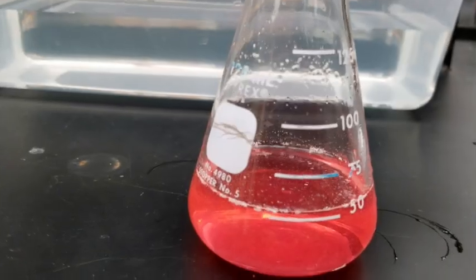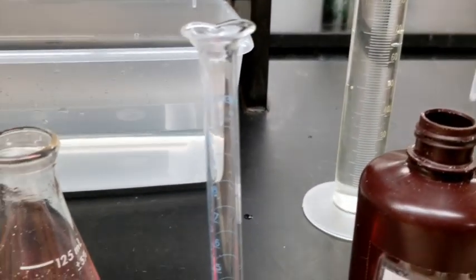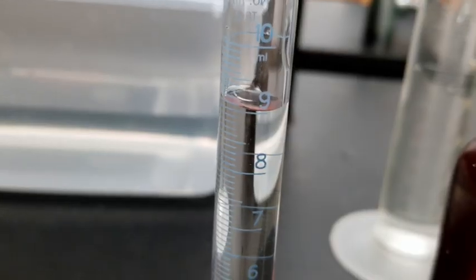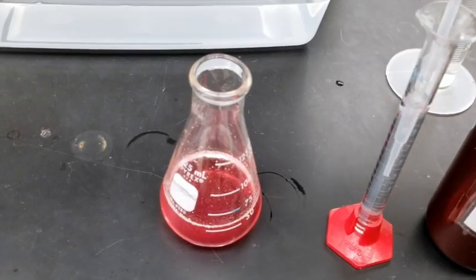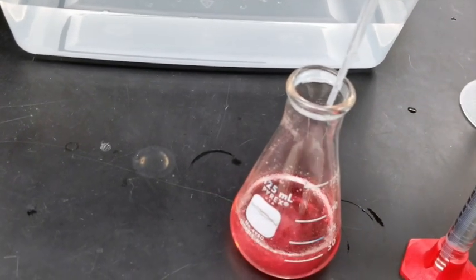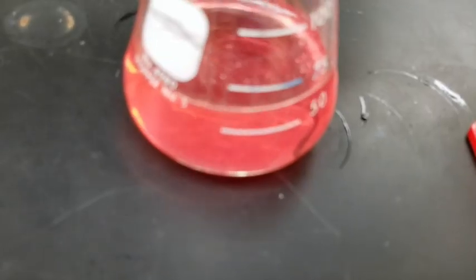The solution should be red. Pour between nine to ten milliliters of one molar sodium hydroxide solution into your 10 milliliter graduated cylinder. Record the actual volume in table one of your handout as initial volume. Using a plastic pipette, add drops of sodium hydroxide from your 10 milliliter graduated cylinder to the Erlenmeyer flask that contains the mixture of acid and the tablet.